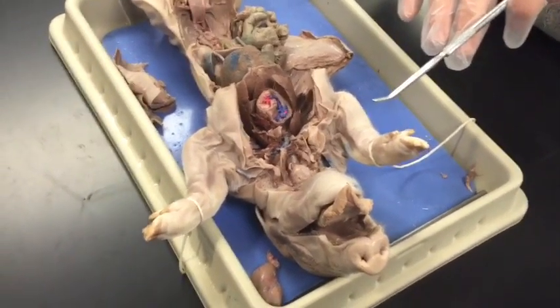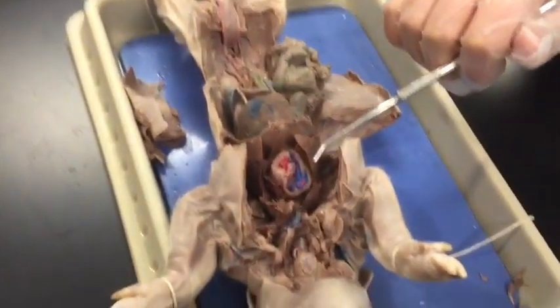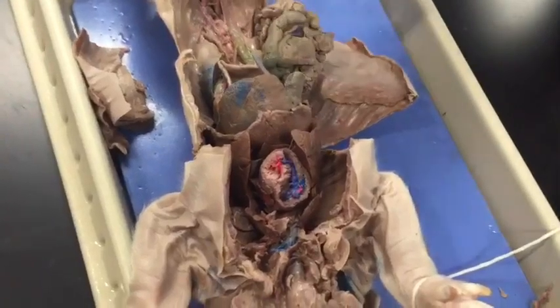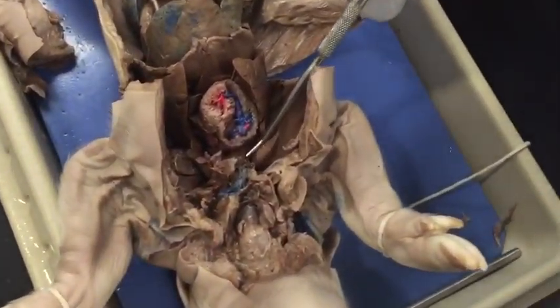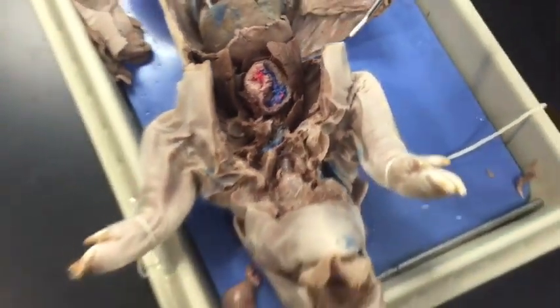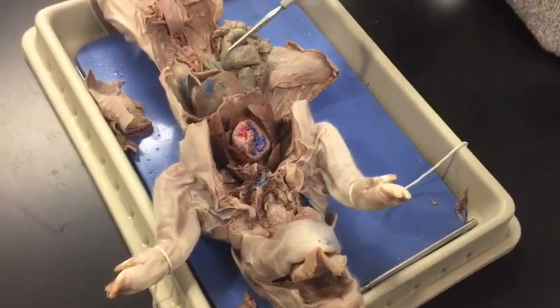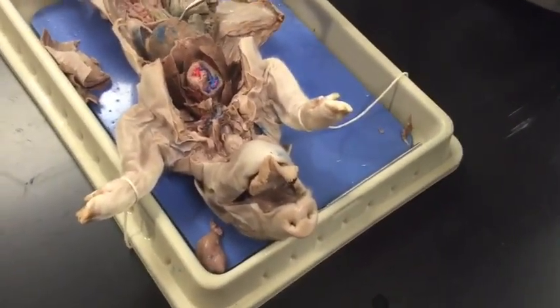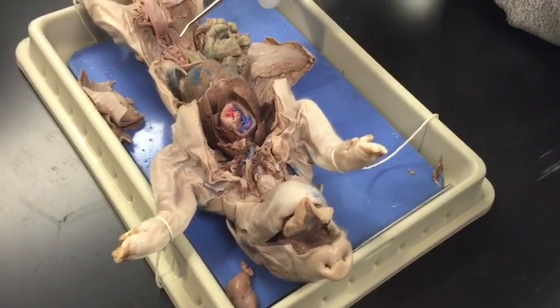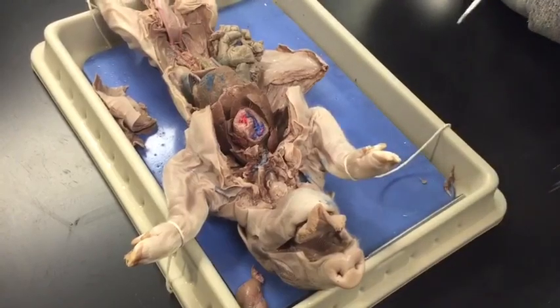The superior brings blood from the top of the body to the heart, and then the inferior brings blood from the bottom organs to the heart, and it's over here. And then the renal artery and vein: the artery carries blood from the heart to the kidney, and then the vein brings the blood from the kidney to the heart, which is then filtered there.